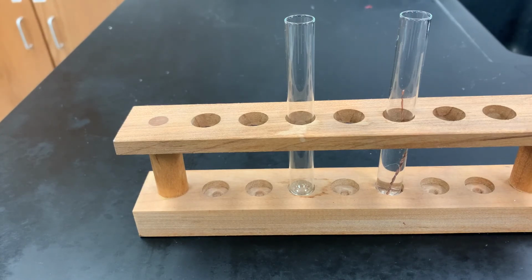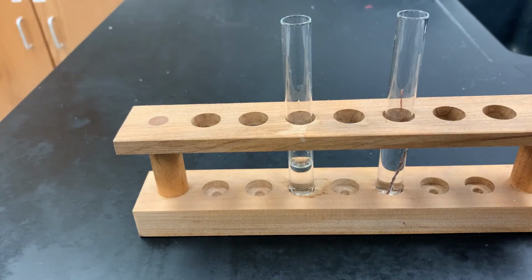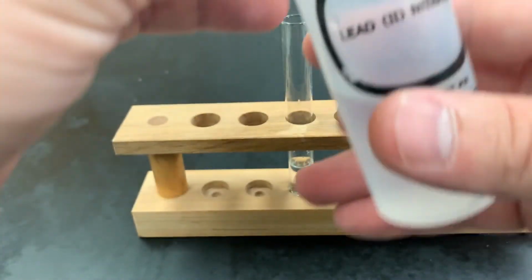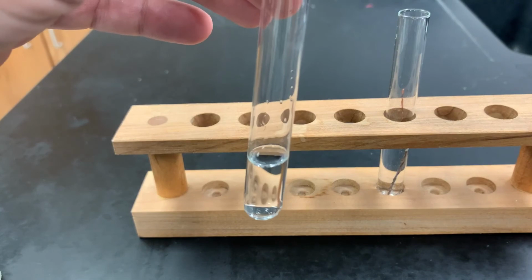Now, while that reaction takes place, I'm going to also demonstrate a double replacement reaction where I'm going to take some potassium iodide and put it in this test tube over here. You'll notice that it is clear in color. It's potassium iodide, KI. And to that, I'm going to add some lead II nitrate, which is also clear in color. It's colorless, essentially.